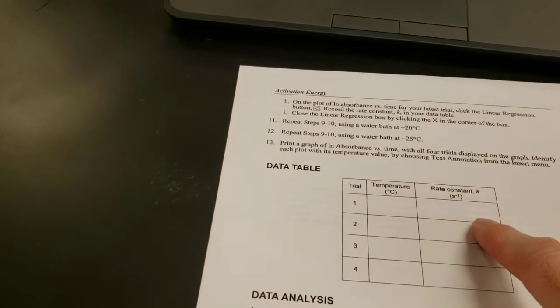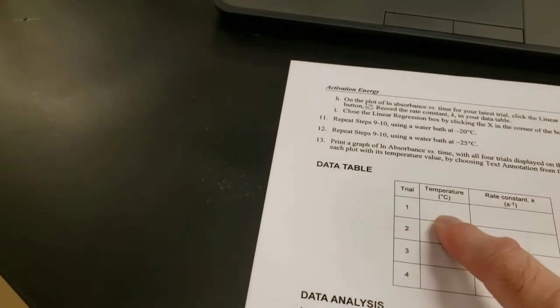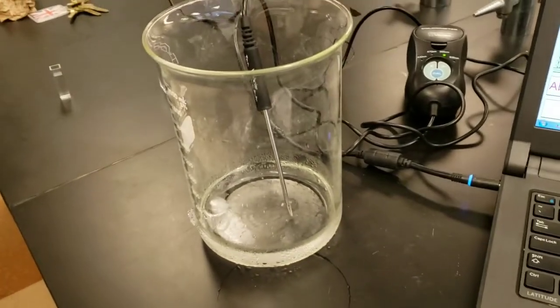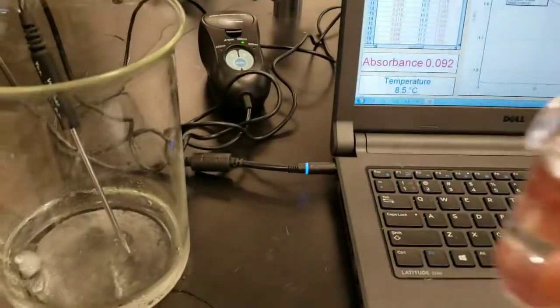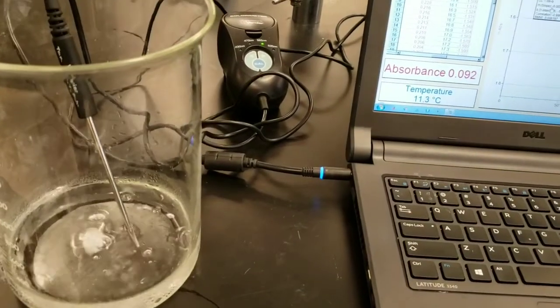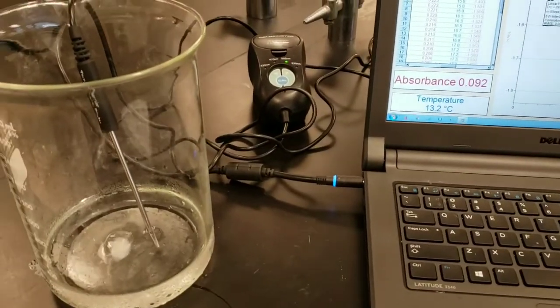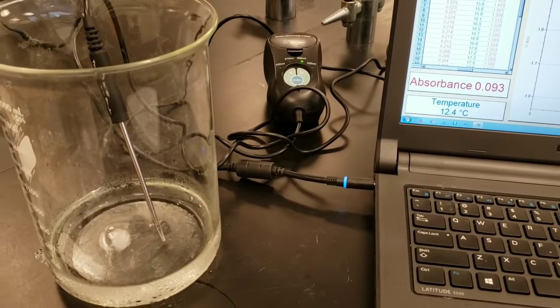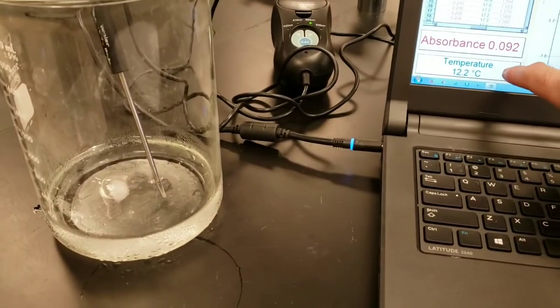Record the rate constant you've just determined at the temperature that the experiment was performed in. In the ice bath, go ahead and add a little room temperature water, and then perform the experiment again at a new temperature.